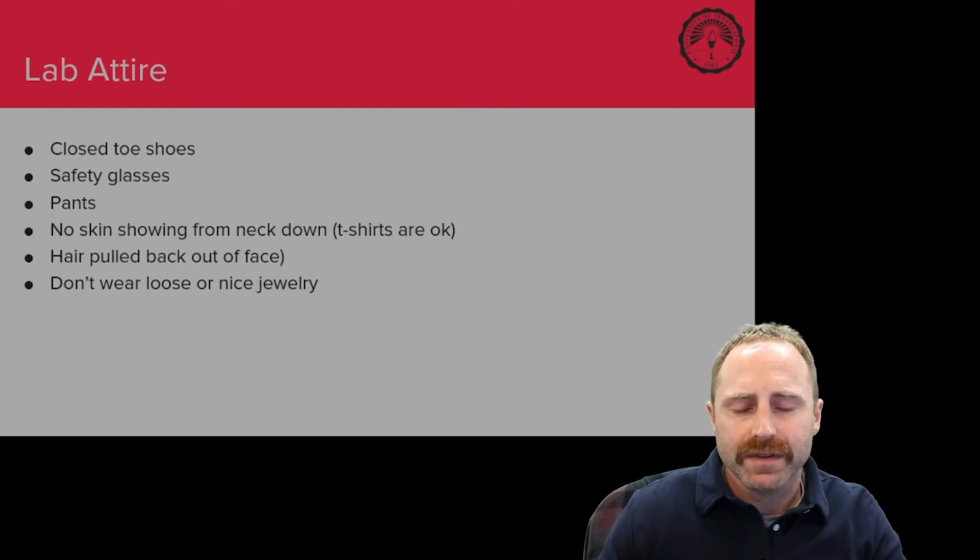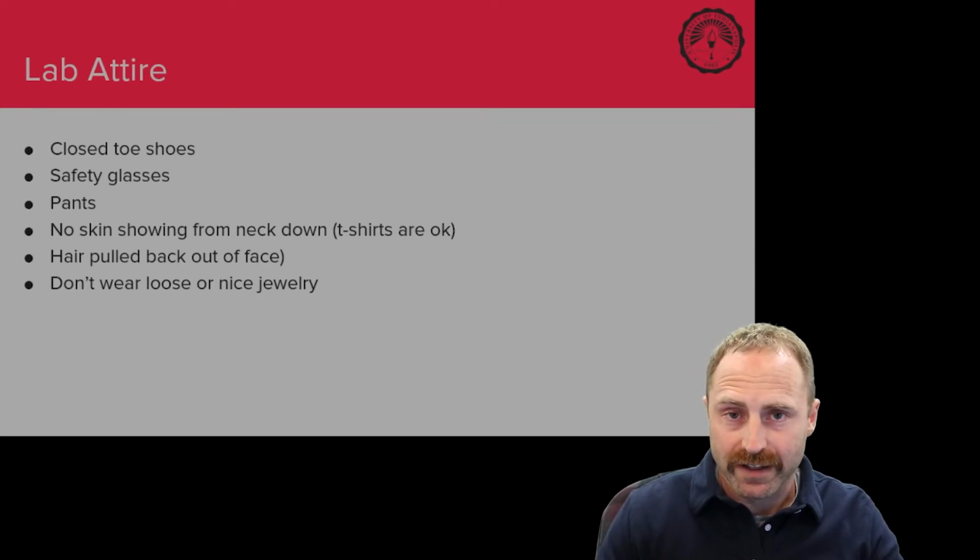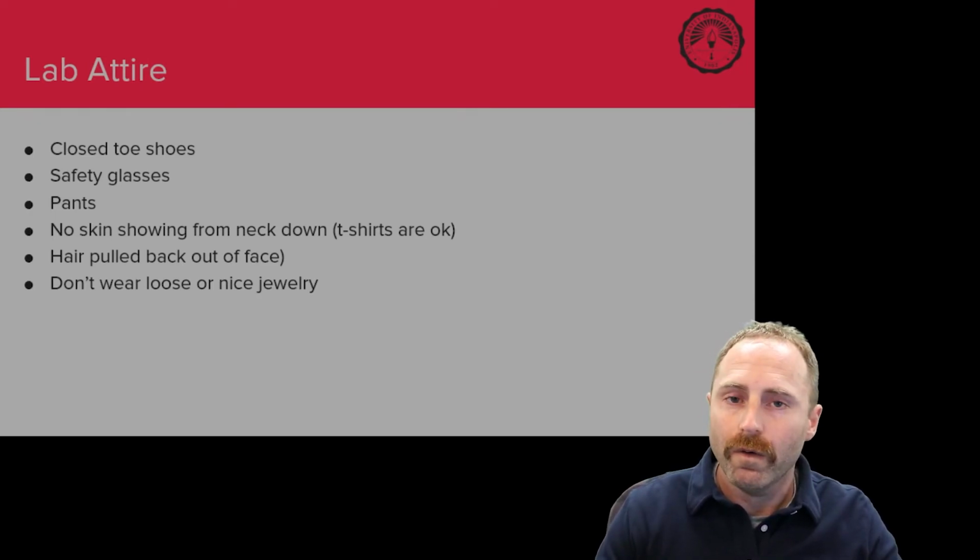Before we wrap this video, I do want to point out laboratory attire. Because safety is such a big thing, you're going to hear us say it over and over again, probably until it makes you just tired of us talking about it. But it is that important. So what do you wear when you come to chemistry lab?